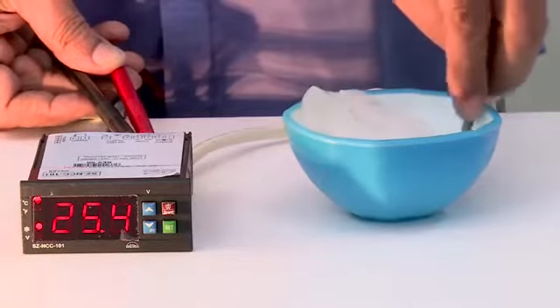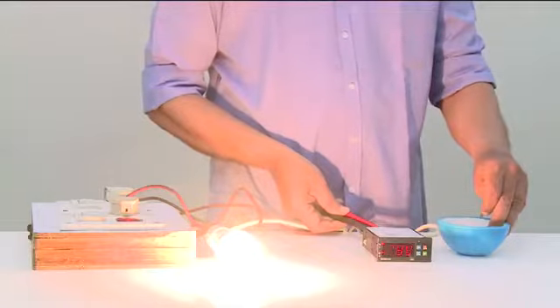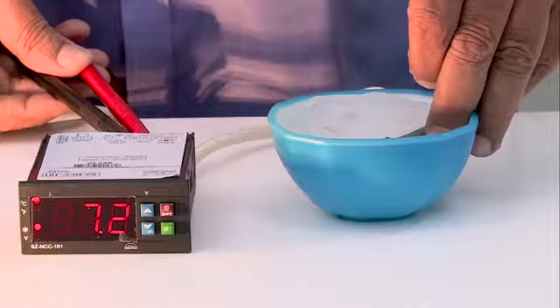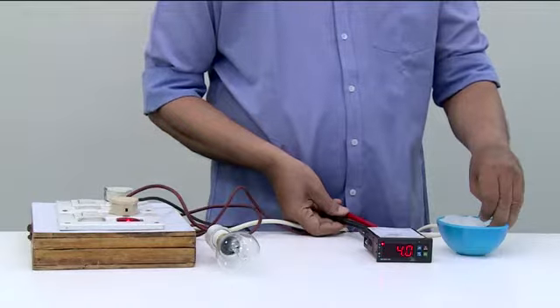We will now put the sensor in crushed ice. The controller is set to cut the temperature at 4 degrees. The bulb turns off, showing that the contacts are now open and the load is disconnected from the controller.